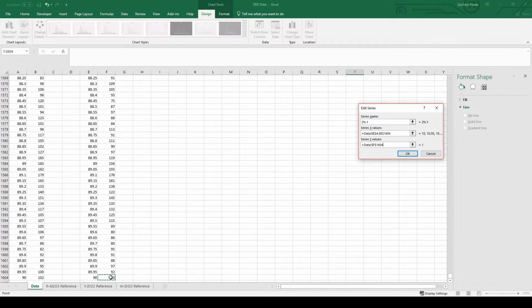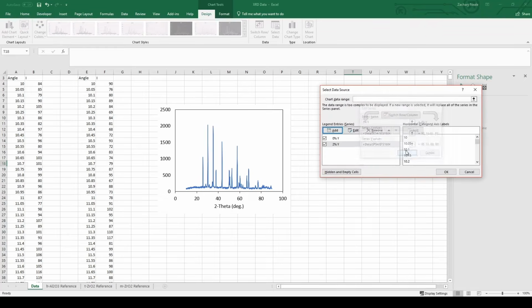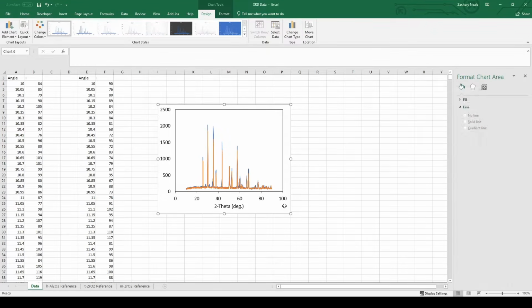Click, you can start from the last value, press Control, Shift, up arrow key, and then we can hold down the Shift button and select the down arrow key to select that last point. So we'll finish there, say OK, OK.